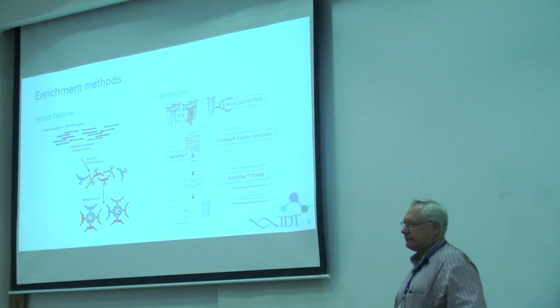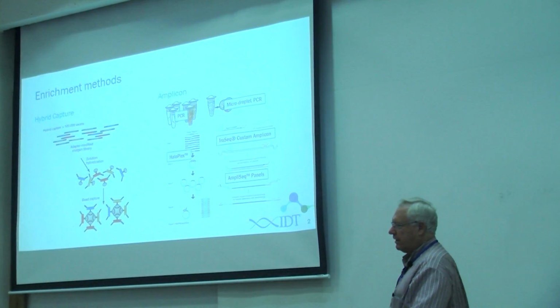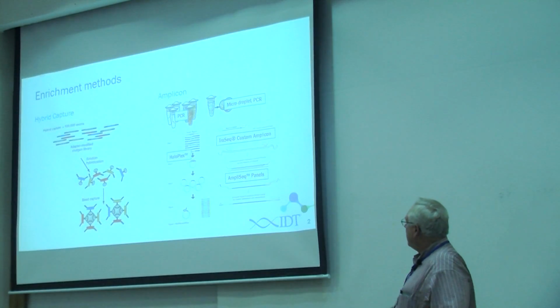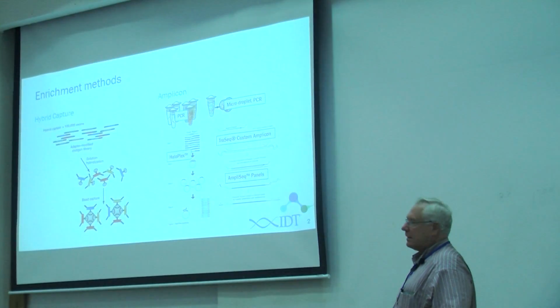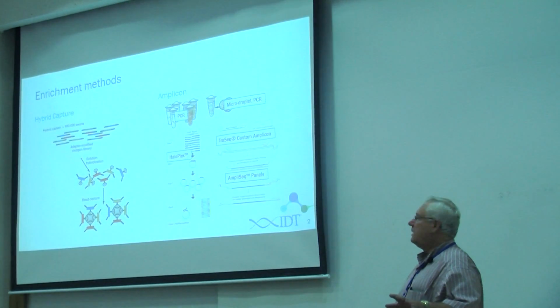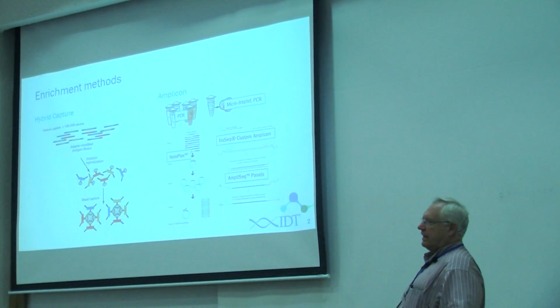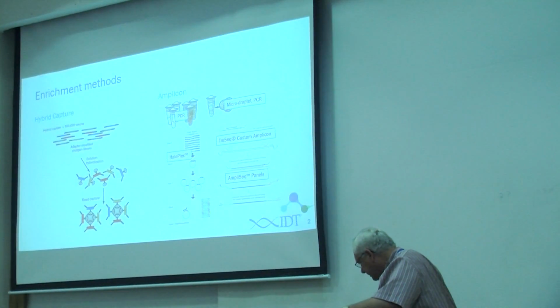And the question just is, does it matter for your patient? Does it matter for this scenario? And you're not going to know. So there's going to be areas where amplicon-based is good, and it certainly is easy. But capture has the benefit of pulling down everything in more of an unbiased way. And how does capture work?